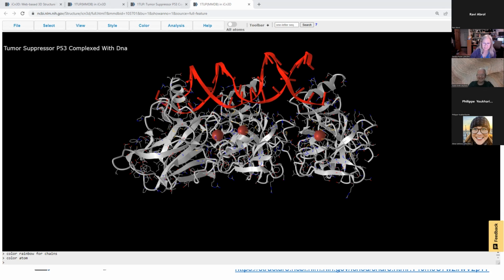No worries. These conversations are exactly why we have events like these. If you want to continue them in the chat, that's perfectly fine by me. I just want to move forward a little bit so we can get through some more stuff and I don't run over time. Another really important aspect of iCn3D or any molecular visualization software is the ability to make selections and make changes to part of the structure, which is what some people have been chiming in on in the discussion.